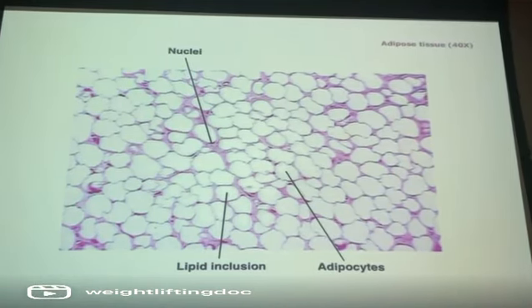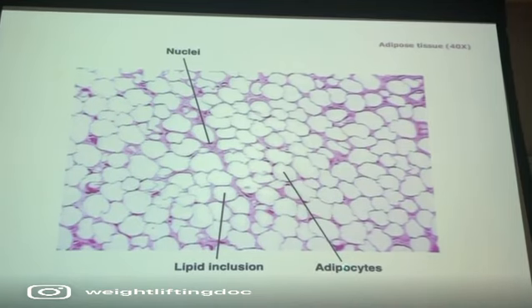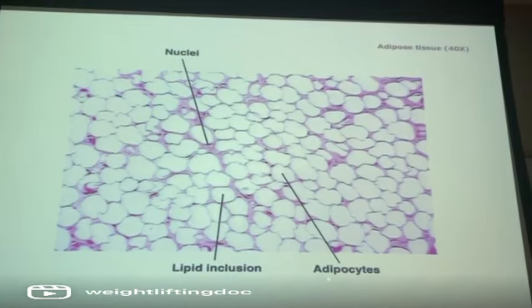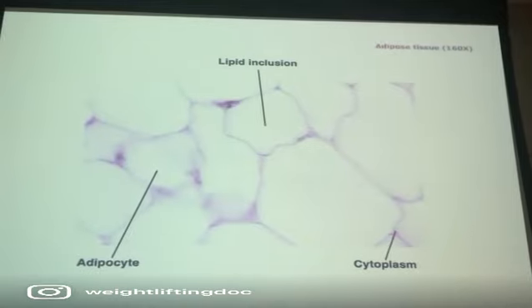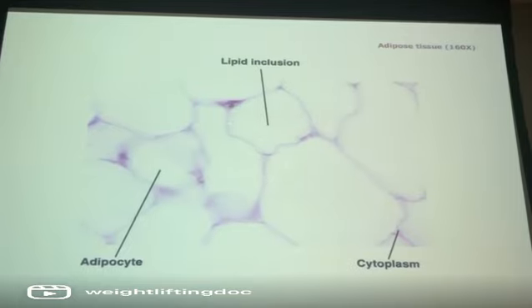Now this has got its own special thing. Adipose is connective tissue, so you're going to say adipose CT or adipose connective tissue. And the cells are called adipocytes. Okay? We're going to make sure we say adipocytes. They're not fibroblasts in this one, and they're not fat cells. We're going to say adipocytes specifically. Same thing, this is a close-up view. Each of these cells is an adipocyte, and this is adipose connective tissue. Again, much more zoom.